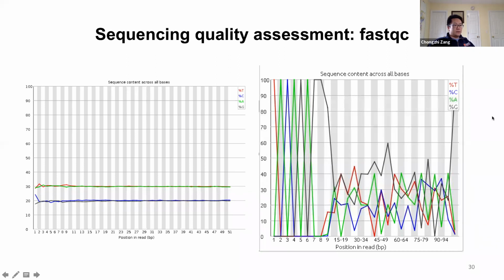And in this case, this is another example. We can see the distribution is very messy, but something we can read from this sequence content plot is that the first base is 100% T. The second base is 100% A. So from the first few bases, you can actually read the sequence. That's T, A, C, A, G, A, and G.